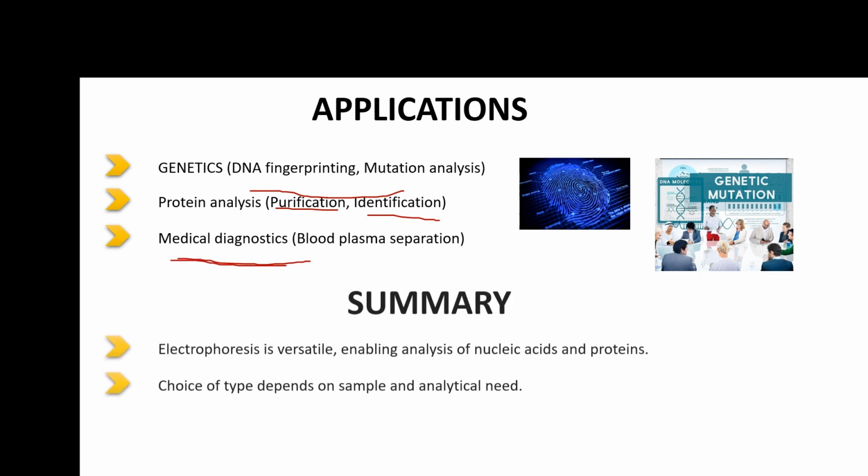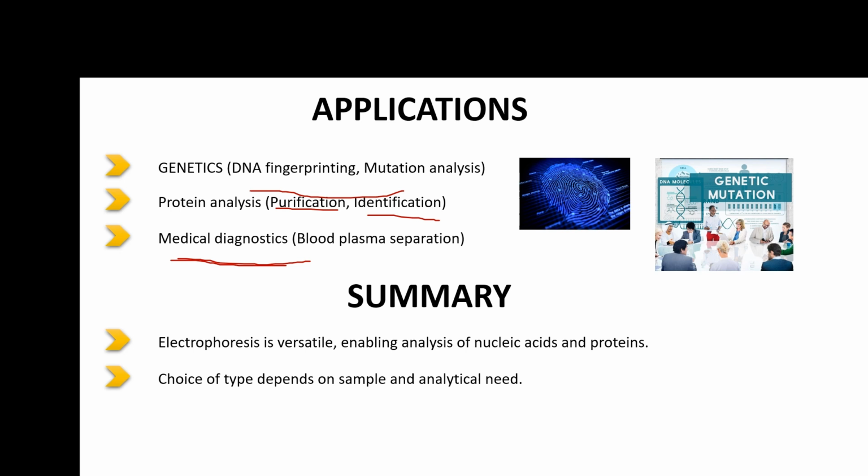It could be used in medical diagnostic centers. And the overall summary is that you have to keep in mind that electrophoresis is a versatile technique, and it enables the analysis of nucleic acids and proteins. The choice of electrophoresis technique completely depends upon the sample you are using and the analytical need you have.